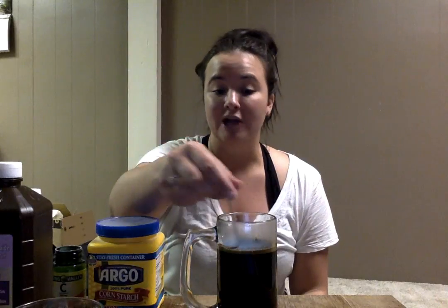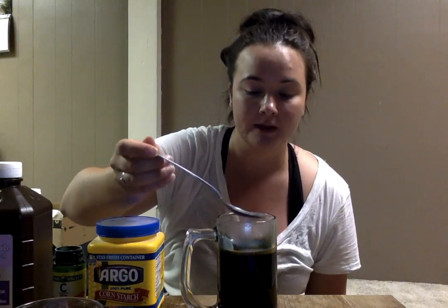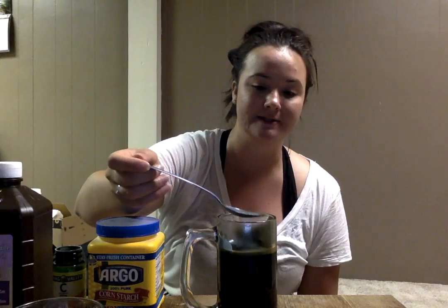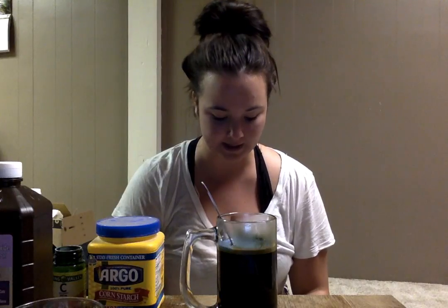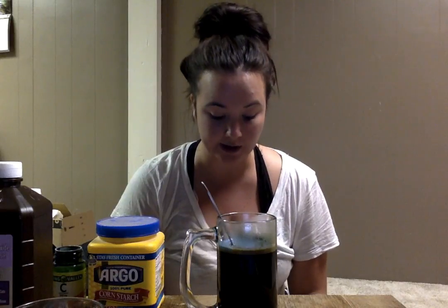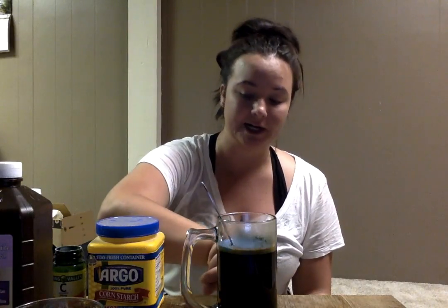When we're looking at this experiment, the reason why it's called a clock reaction is because the color change happens instantaneously. This has got a really cool blue cloud on top of it. The guy in the video guiding us talked about how it kind of looks like Coke, and this one definitely has the blue cloud that he was talking about, which is kind of cool. We're looking for our reactants to disappear, which they did. In this case, it was solution B, which was our limiting reactant, and solution A was in excess. So our product is generated here.